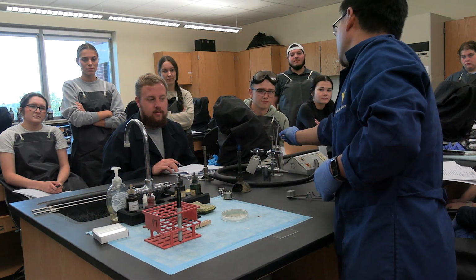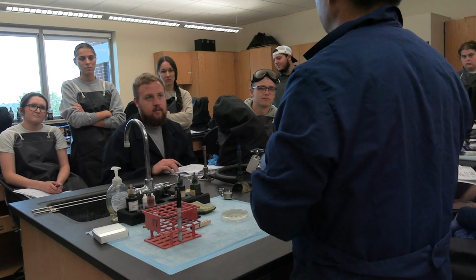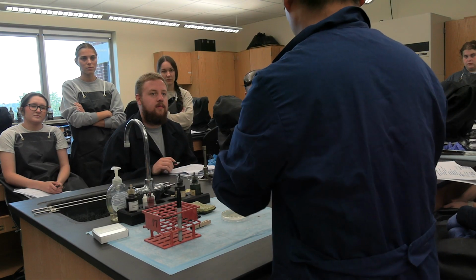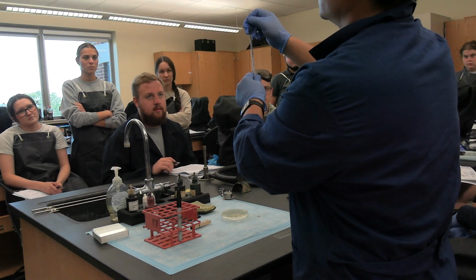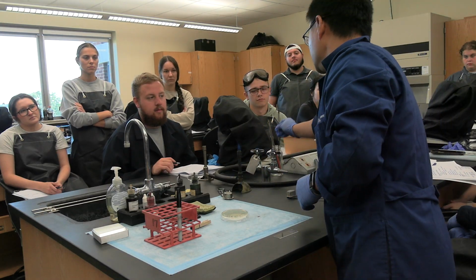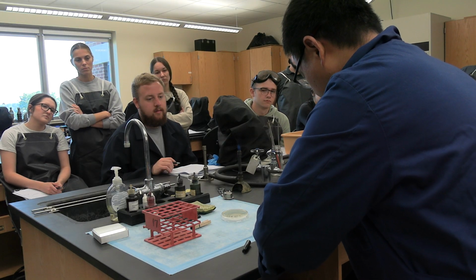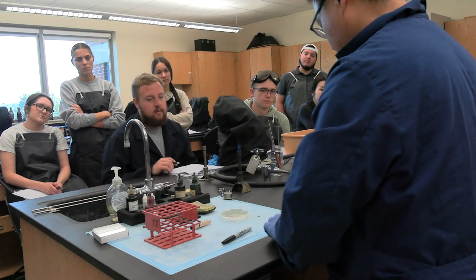So we want to have a loop ready. Make sure these things are ready. You need to use a loop, which means on the top there is a circle. This is not a loop. That's called a needle. There's no circle. We will use it later when we do the biochemistry test. Now what we do is label. Draw a big circle right on the corner, EC, and then flip it over.